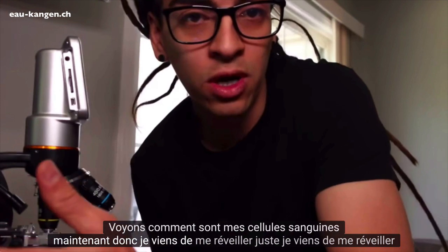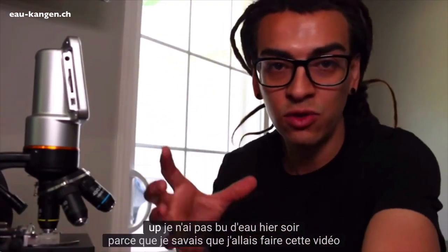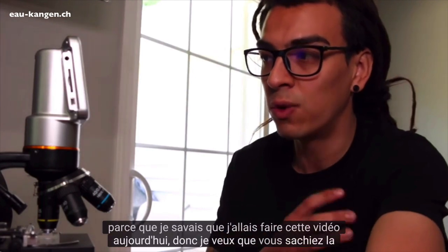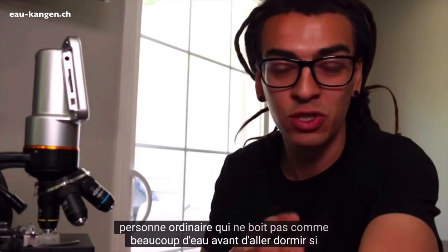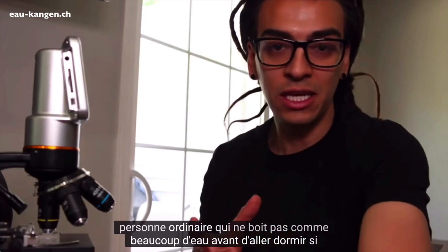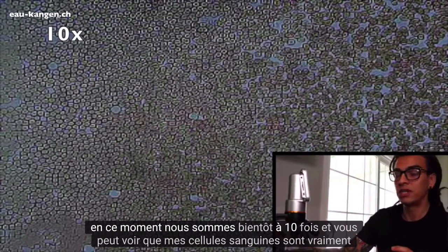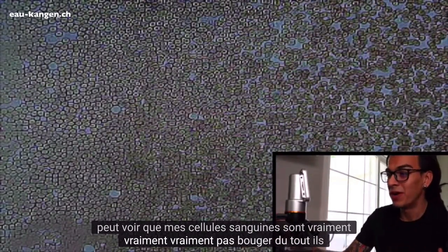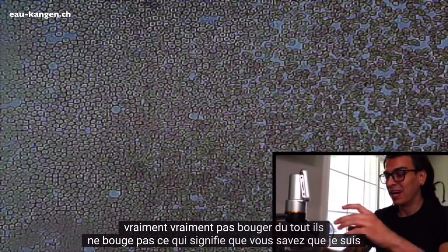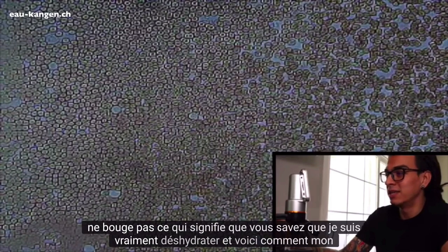So I just woke up, right? I didn't drink water last night because I knew I was gonna do this video today. So I wanted to be the regular person that doesn't drink as much water before they go to sleep. So right now we're at 10 times zoom, and you can see that my blood cells are really not moving at all, which means that I'm really dehydrated.